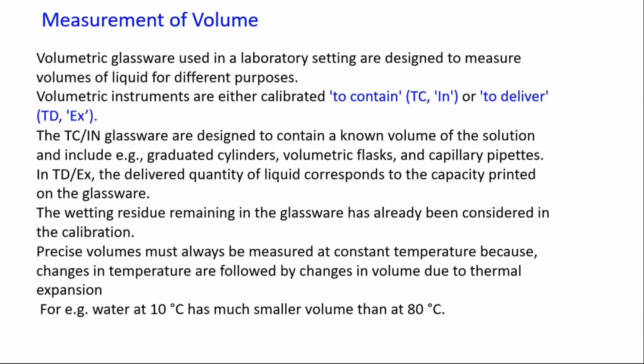Then we come to measurement of volume. We have a large amount of volumetric glassware in the laboratory, and this volumetric glassware is designed for measuring different volumes.